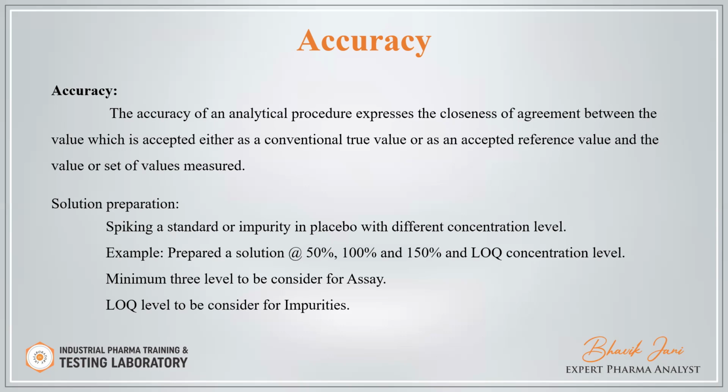For example, prepare the solutions at 50%, 100%, and 150%, and the LOQ concentration level.